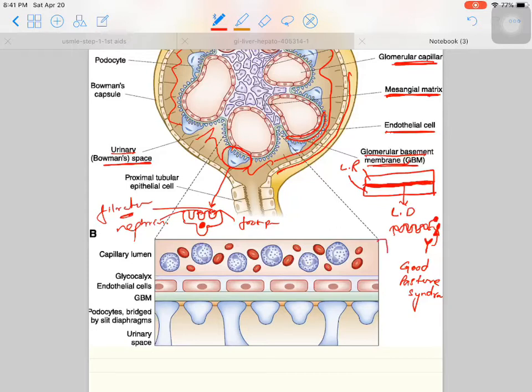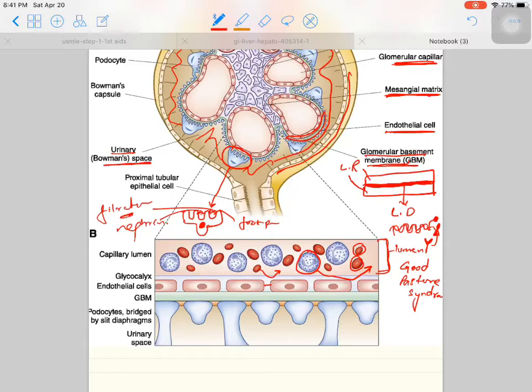Looking more deeply, this is the blood capillary lumen in which blood cells are flowing. White blood cells cannot pass through the glomerular filtration because the fenestrations between the endothelial cells are so small that they will not allow blood cells through. Similarly, special proteins such as fibrinogen and globulin cannot easily cross either. So the endothelial fenestrations provide a size barrier.